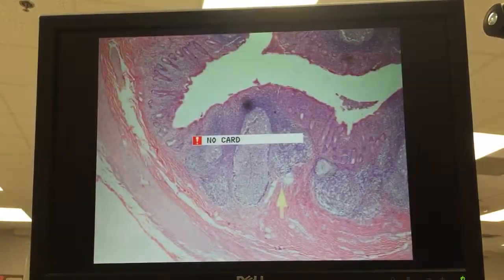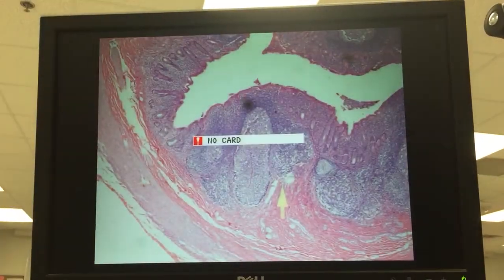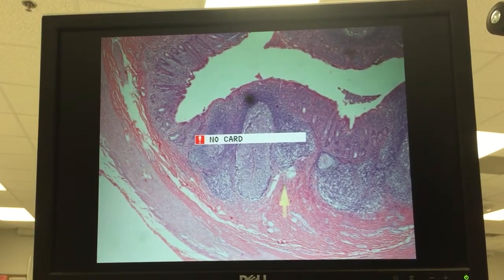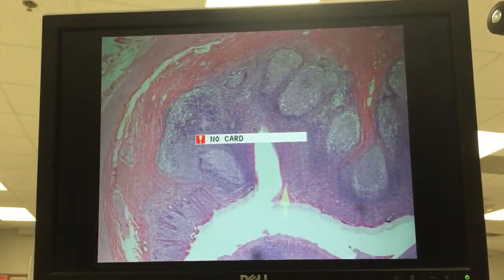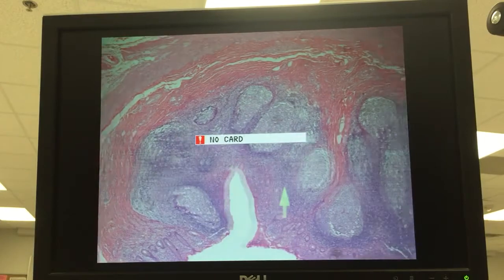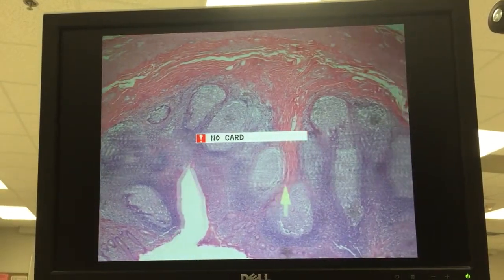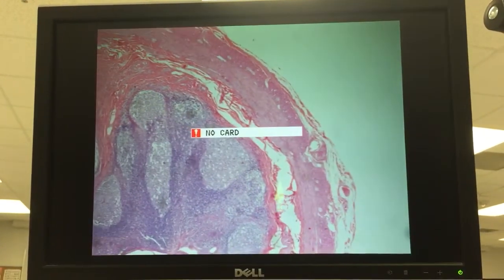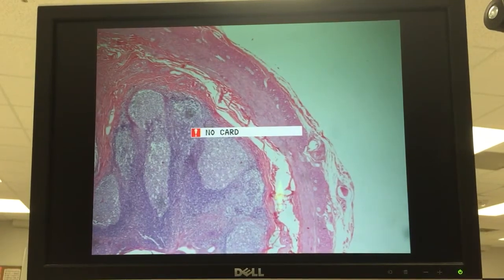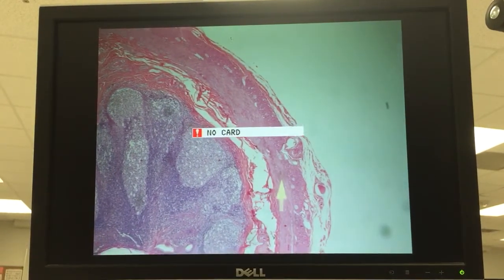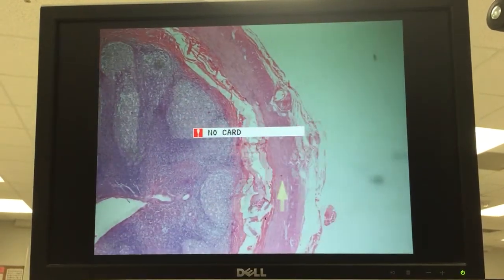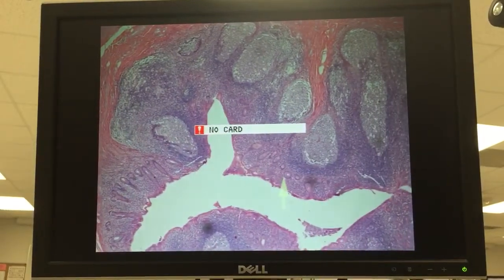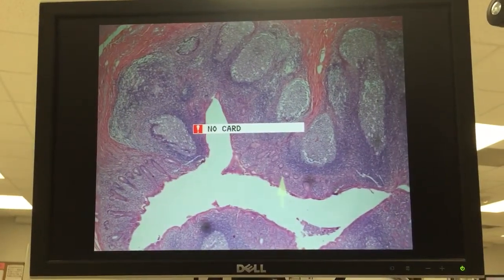The muscularis coat is complete, so there will be an inner circular and an outer longitudinal. This one is fairly clean for the appendices that we have in the collection — a little bit of degeneration here, but actually looks fairly good. Same layers, and you need to identify this as the appendix.